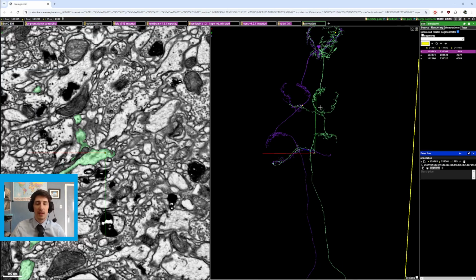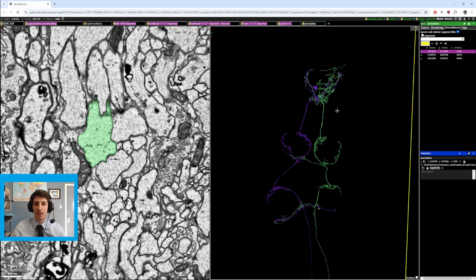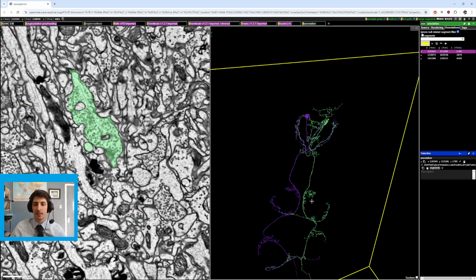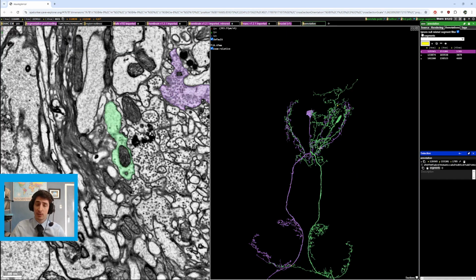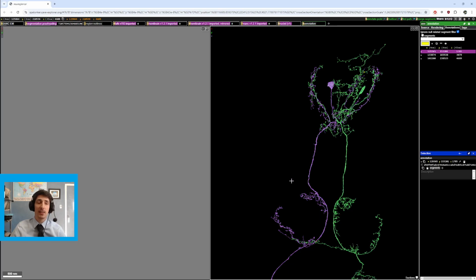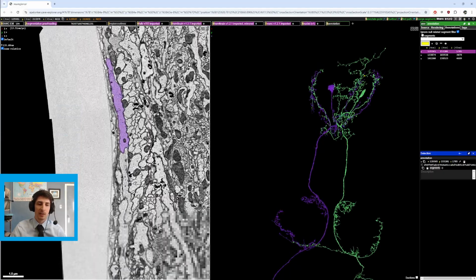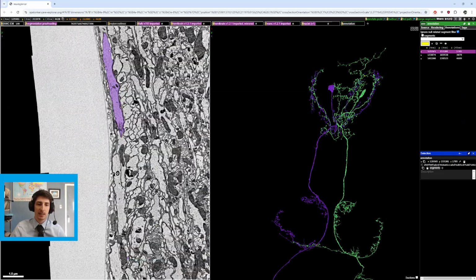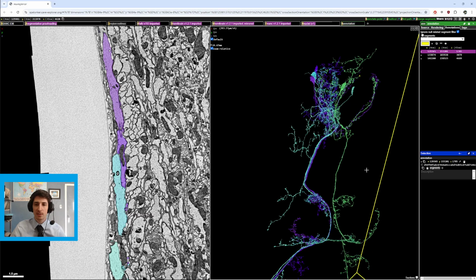But without looking at these annotations, I'm just going to turn the crosshair off with the letter A. Without looking at the annotations, when I see this pair of cells, your task might not involve having two cells up at once, but one way that you can find similar cells is you go along the backbone here and look for any other shapes that are doing the same thing, and you just click on those. And as you can see, we can get a couple other similar looking ones.